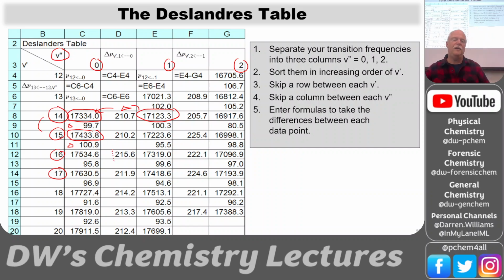And so we can look. Now, if you wanted the vibrational difference down here, you could average that column, right? And you've got the 0 to 1 vibrational difference. But you don't have to do that, because that's what the regression does. The regression analysis, the analysis of variance, gives us all of these averaged, all of the differences up here and all the differences down here, and gives you the best coefficient for all of them, and gives us your uncertainty.